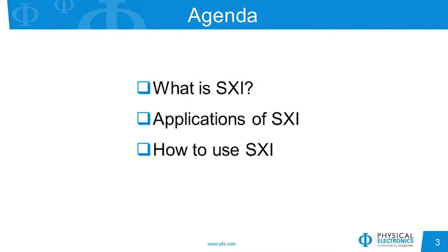First, I will introduce the concept of SXI as it relates to PHI XPS systems. Next, I will talk about some of the applications and uses of SXI. And then lastly, look at some examples of how within our software we can use the SXI for us.